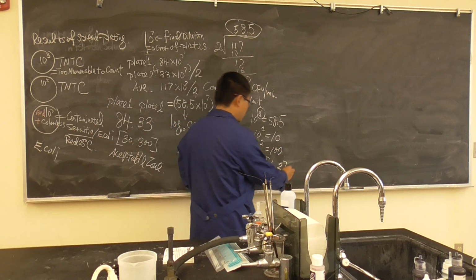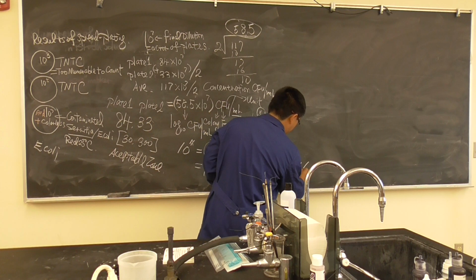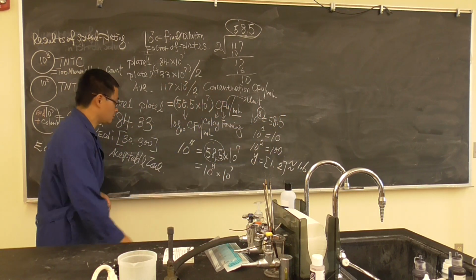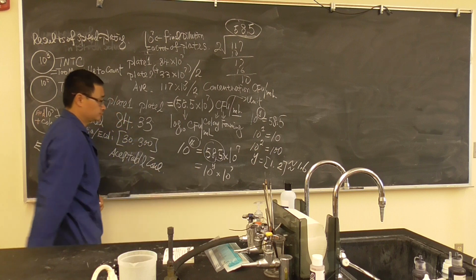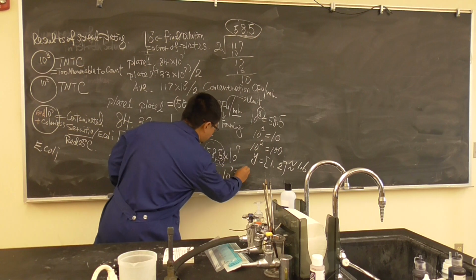You can use a calculator. I did about maybe 1.6ish. You use a calculator, I'll tell you it's the same. So what is that x? This y is 1.6, so this x equals 8.6.